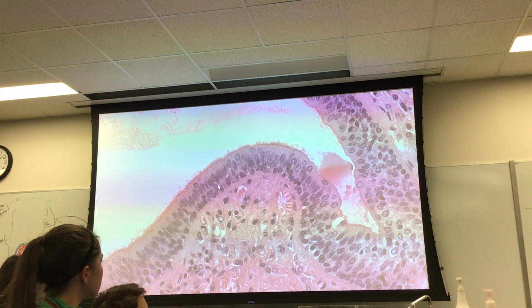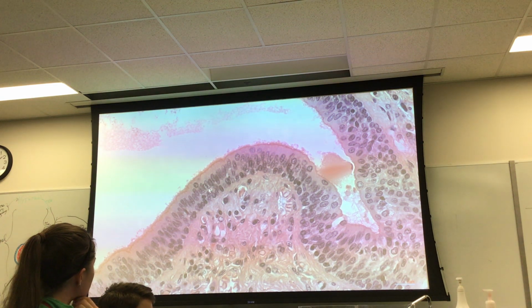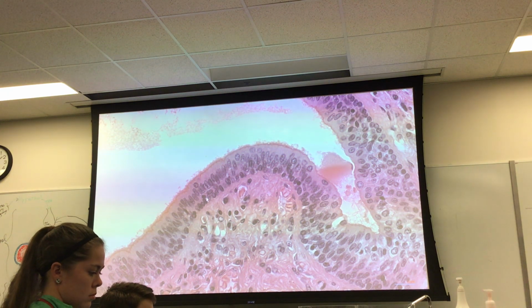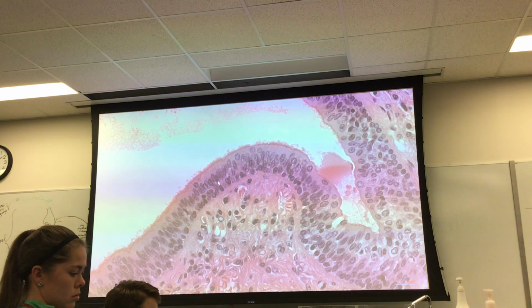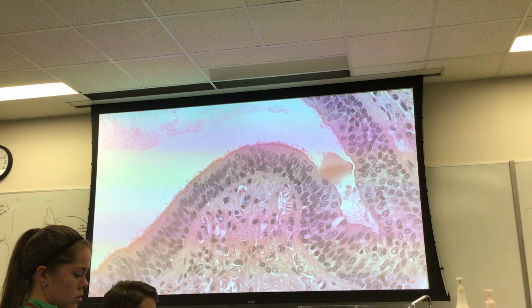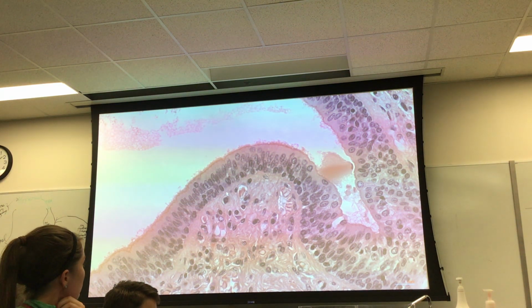Probably, right? Because again, these nuclei right out here, they have to contact the basement membrane, and there looks to be too many intervening nuclei. So it's stratified. But now the question is, just to drive this point home, but we mentioned it before, these cells, how would you describe their shape through here? Columnar, right? And so in this case, it's not transitional because the long axis of the rectangle is perpendicular to the basement membrane. So this is a stratified columnar epithelium. So I just want to make those points known.